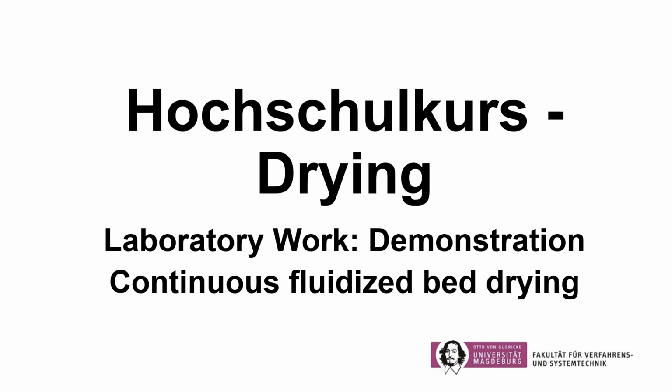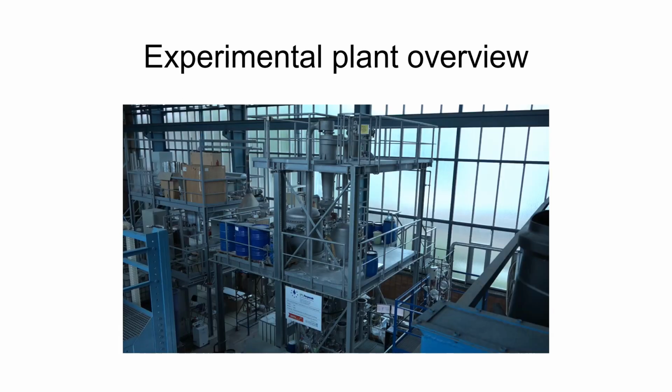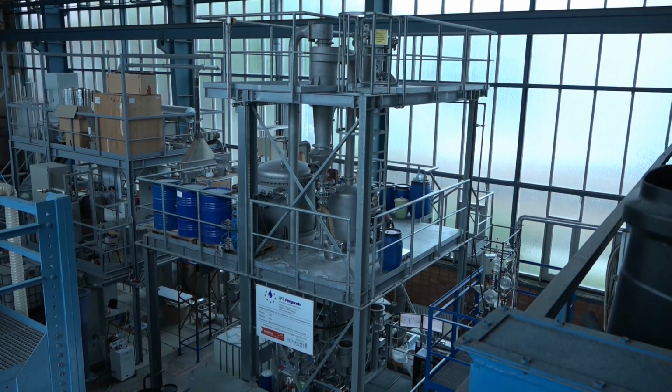Welcome to the laboratory work demonstration of the continuous fluidized bed drying process. So first I just start with a short overview about the equipment.